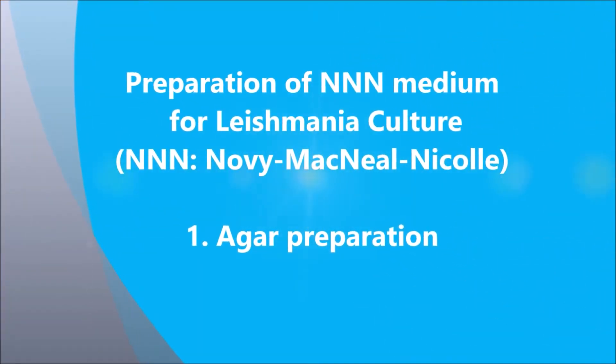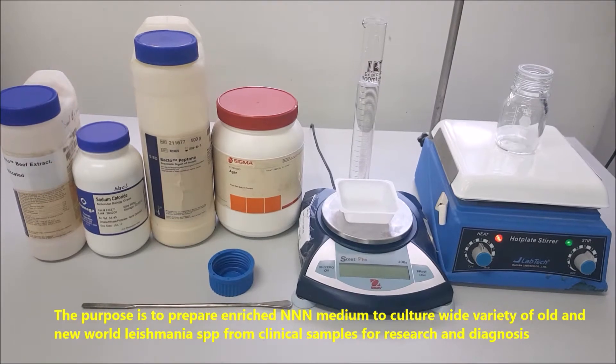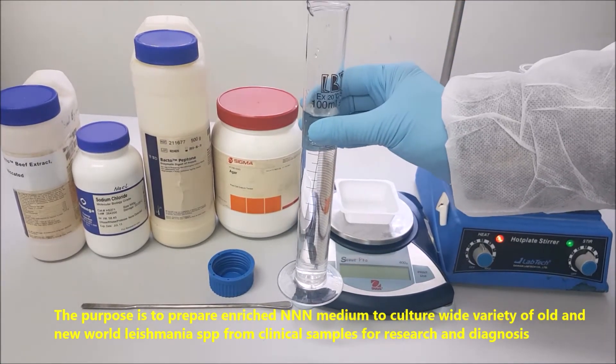Preparation of triple N medium for Leishmania culture. Agar preparation. The purpose is to prepare enriched triple N medium to culture a wide variety of old and new world Leishmania species from clinical samples for research and diagnosis.